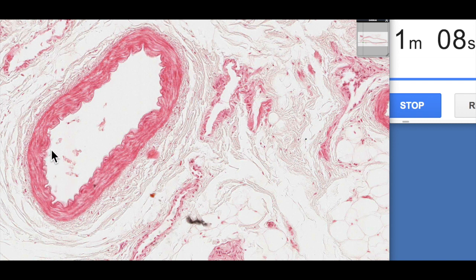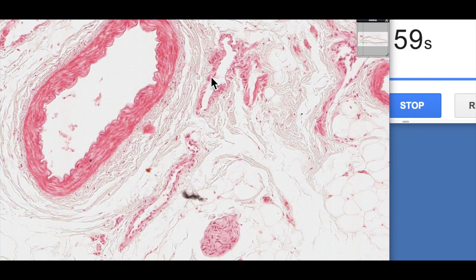You can see that waviness here. So this is our internal elastic lamina, we've got our smooth muscle in our tunica media and then we've got our adventitia.